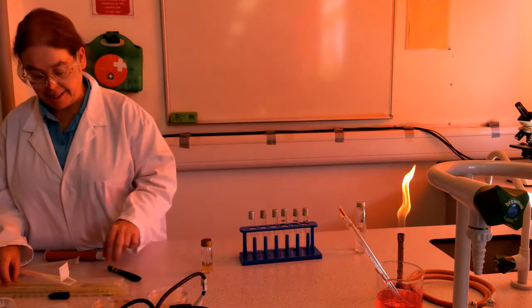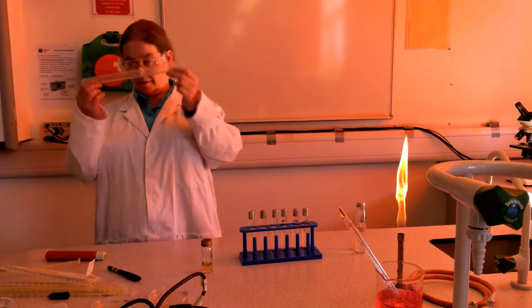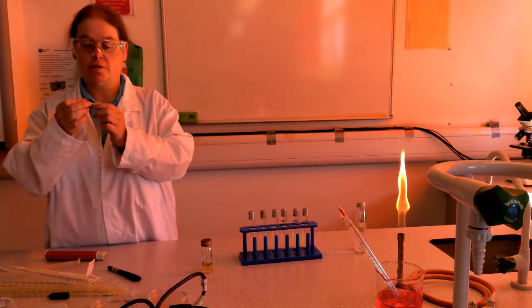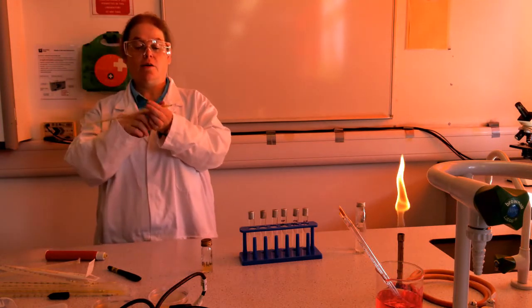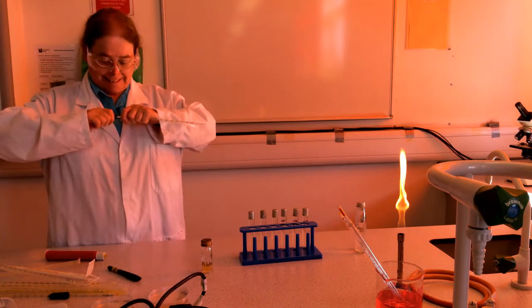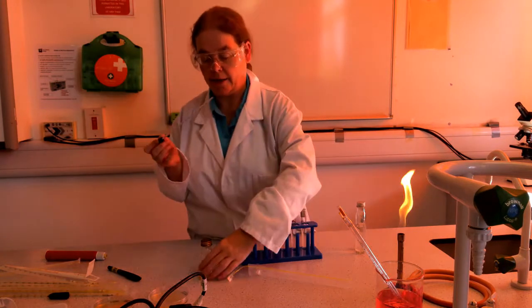So it's a bit tedious to watch, but nowhere near as tedious as it is to do when you have to do this as we used to in the lab, when you had to do 12 or something of them because you had 4 bacteria. So let's rock and roll. Again, correct sterile technique.